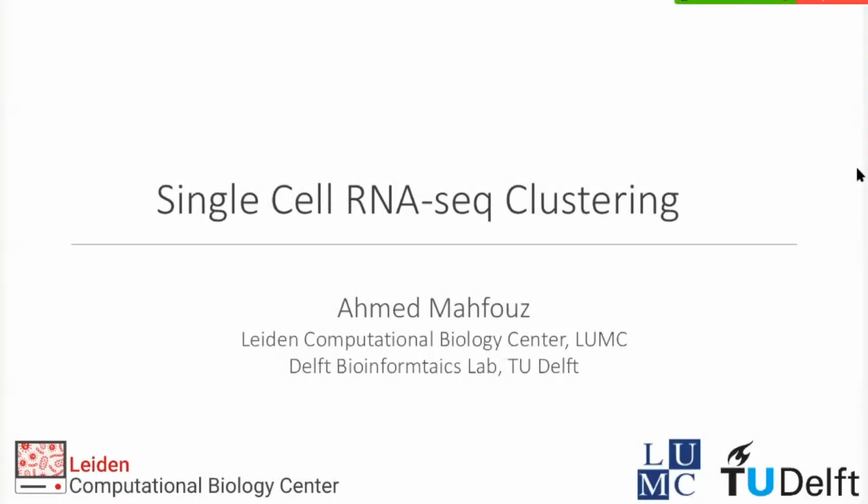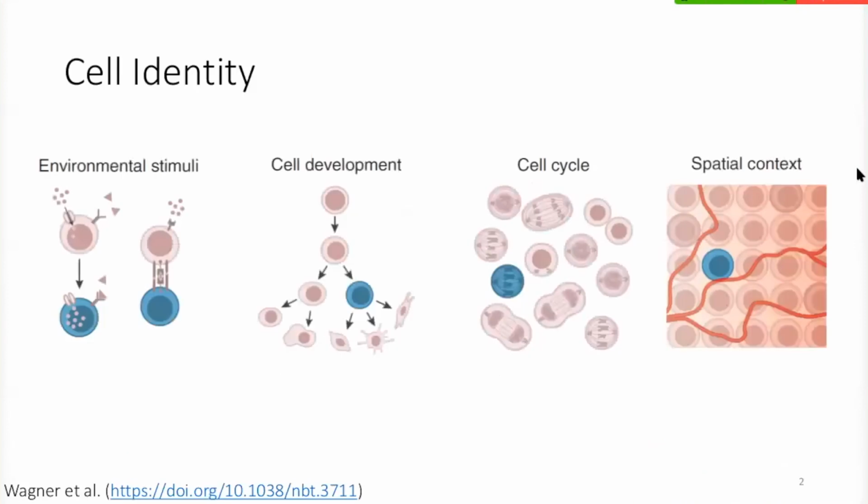All right, so shall we start with the clustering part? Okay, so all the steps you have done so far, you've done a bit on the QC, and now we have cleaned your data. We looked at dimensionality reduction and so on. And one very important step that you need to do now is to identify the cell populations that you have in your data.